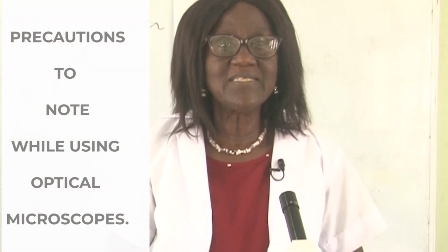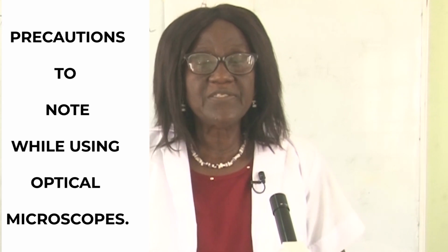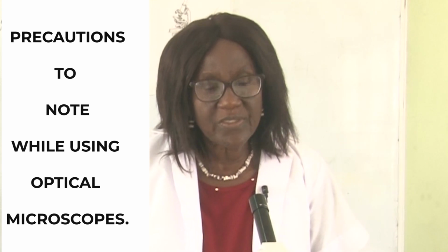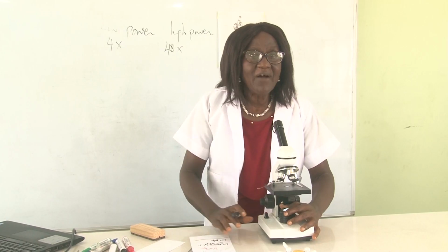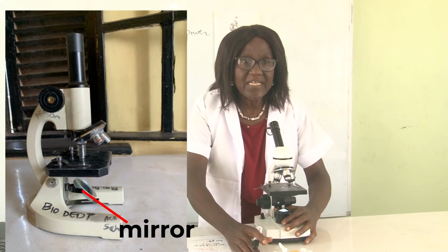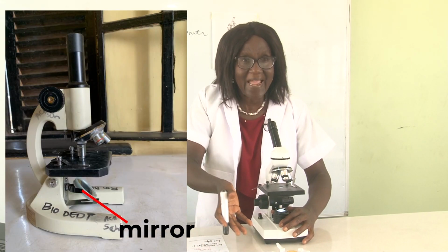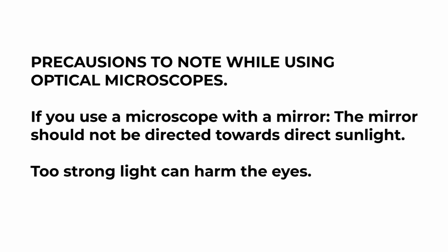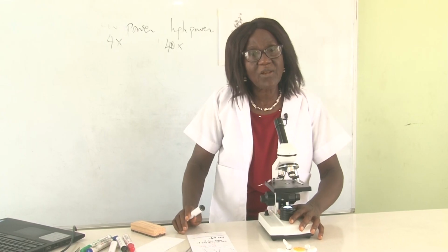We also want to look at some precautions whilst you are using the microscope. If the microscope is not an inbuilt one with light and you have a separate mirror that you have to manipulate to trap light, then don't direct the mirror directly to sunlight. Otherwise, too much light will get in and will affect your eye. That is one of the precautions to note.